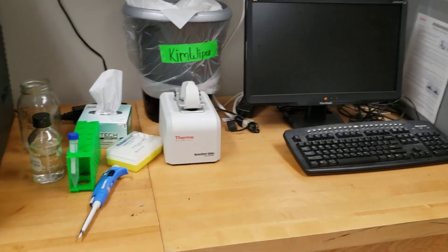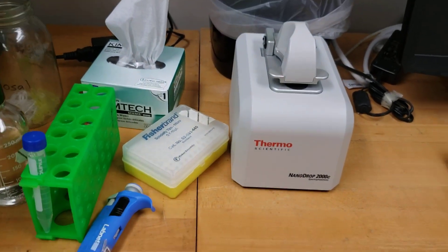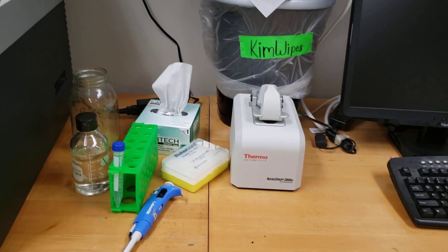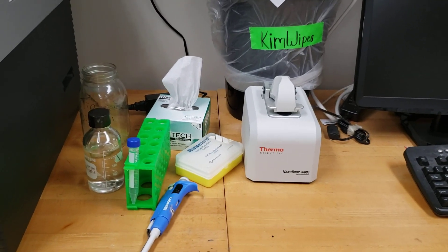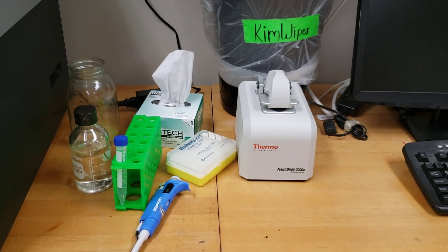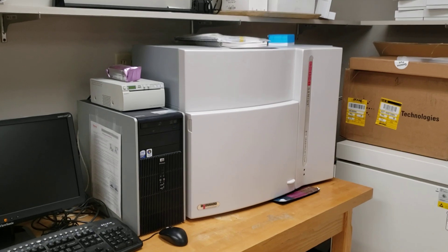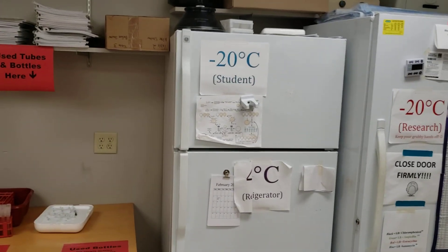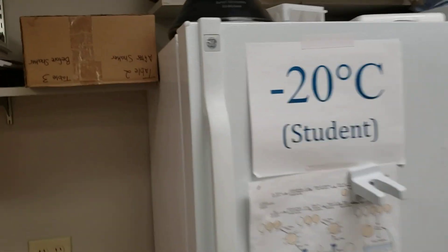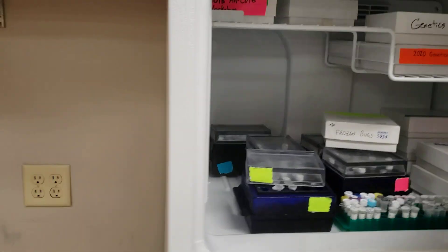One thing I really like is my NanoDrop. It allows us to very quickly determine DNA concentration and DNA quality. We used to do this quite a bit using a gel rig, but the NanoDrop has really sped up what we do. I do have a gel documentation system but it has not been turned on in about five years — it's just easier to use my transilluminator and the picture quality is better. Students also have a refrigerator with all their color-labeled kits.